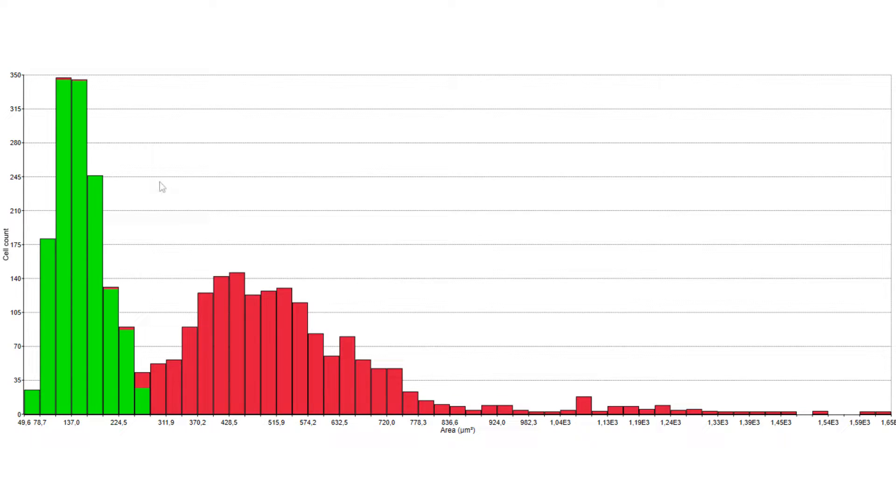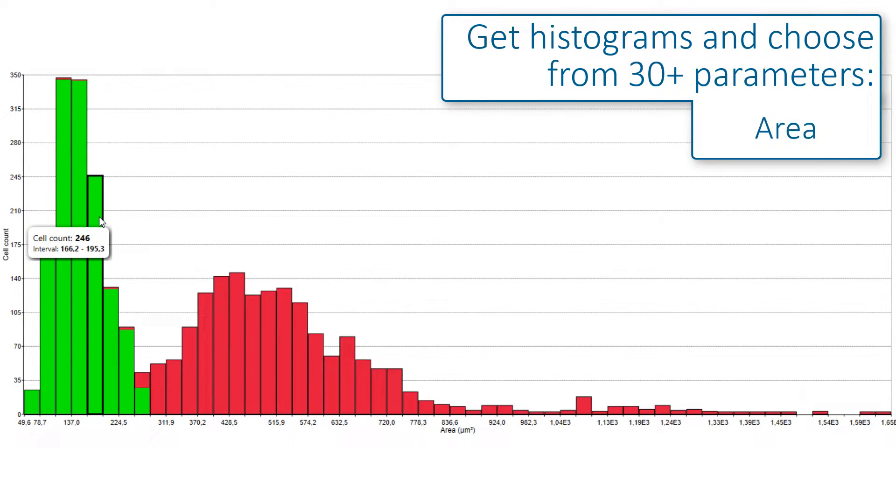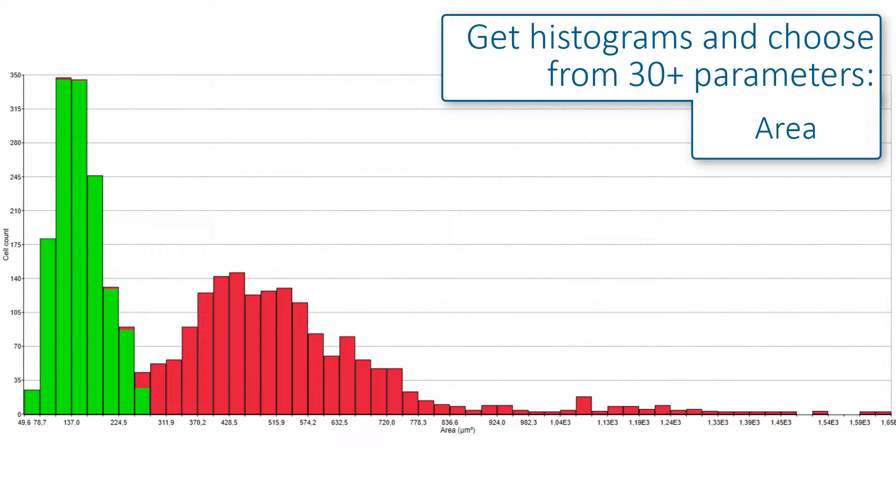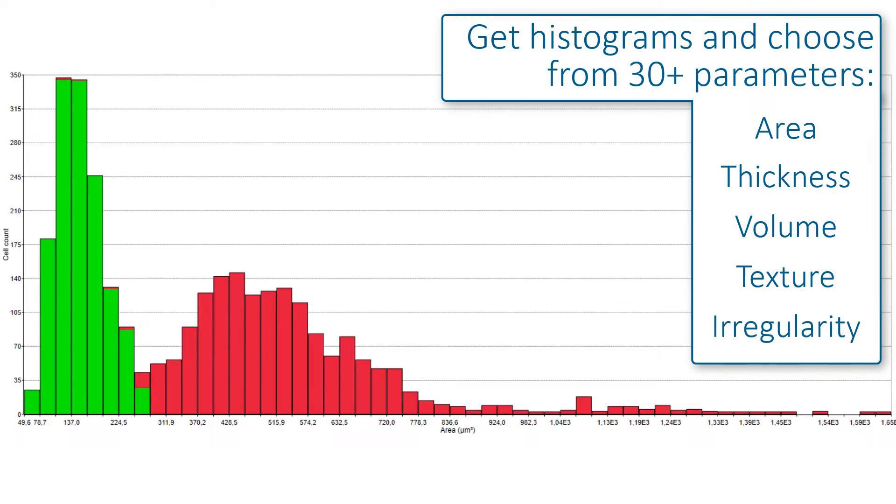You can also view your results in a histogram. Here, the cell area is depicted, but you can choose from more than 30 different morphological parameters, including thickness, volume, texture and irregularity.